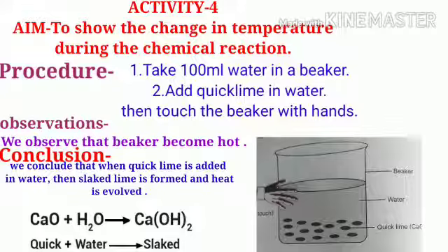We will observe that the beaker becomes hot.